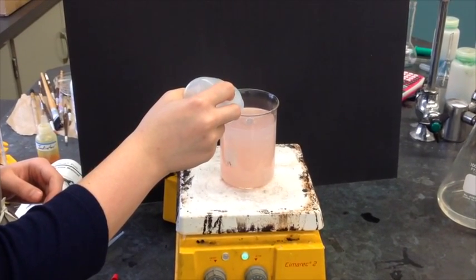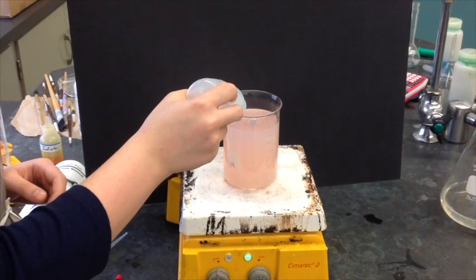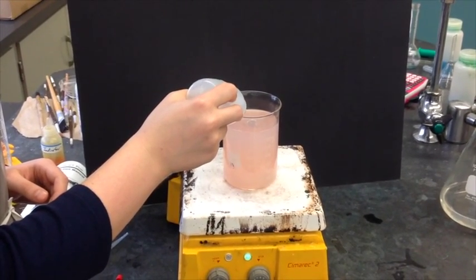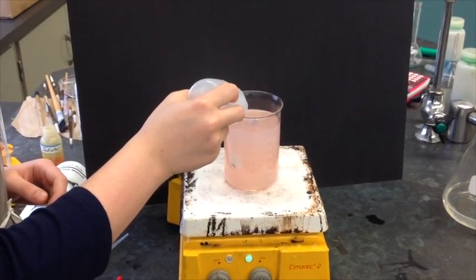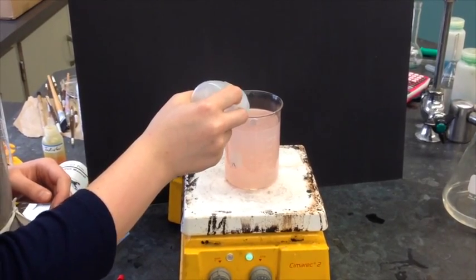Keep in mind though, this is just an estimate of the isoelectric point for casein because it's really hard to get an exact estimate since it's hard to tell exactly where the most cloudiness is during the reaction.